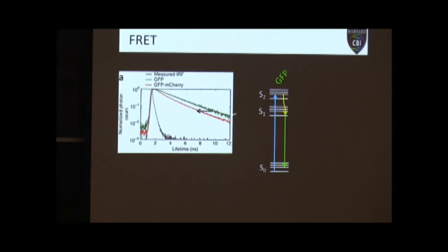Okay. So why does this shift to the left? This is a question that kept me up all night last night, and actually I had to do the old Millionaire phone a friend to figure this out. Okay, because essentially what we're doing is we're only looking at our GFP. So why is the lifetime getting shorter?